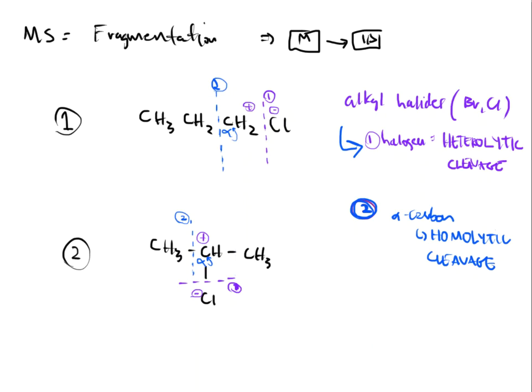Okay, so let's look at option number 2, because we really didn't assign a positive charge to one of those fragments, did we? The only thing that we did is we said, hey, well, it can cleave here and it can cleave there, and these are our pieces. So I'm going to clear out this screen. I'm just going to do a summary up here at the top.